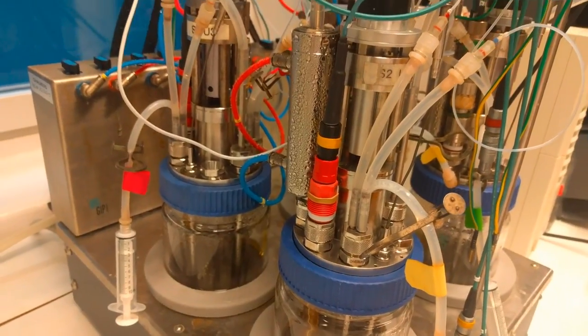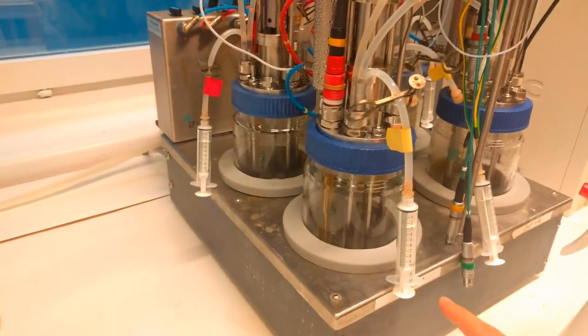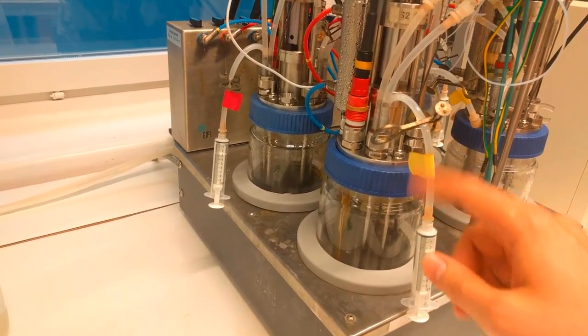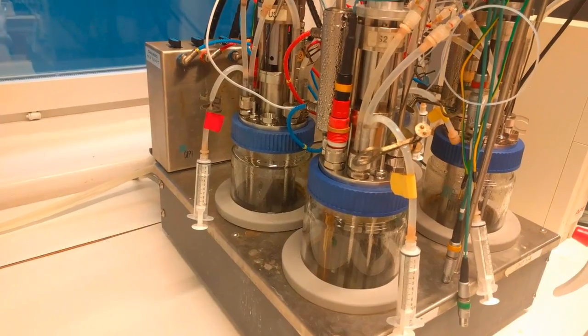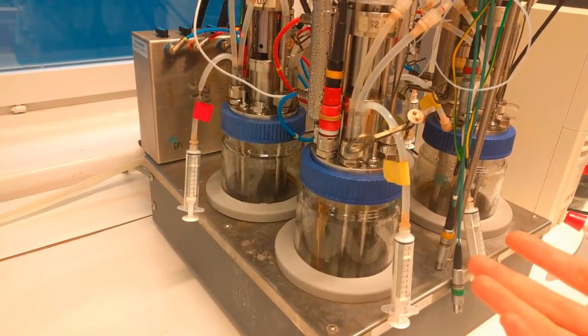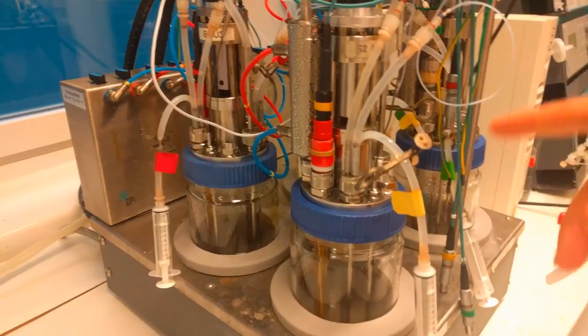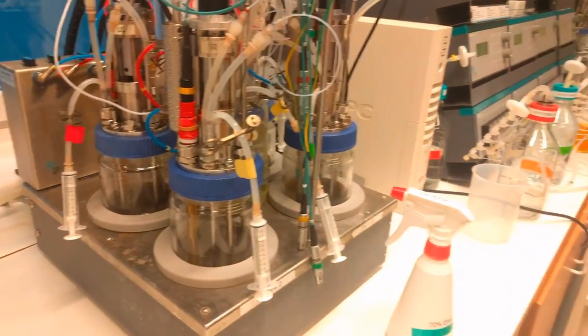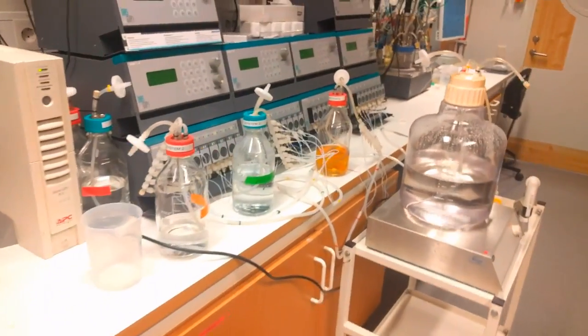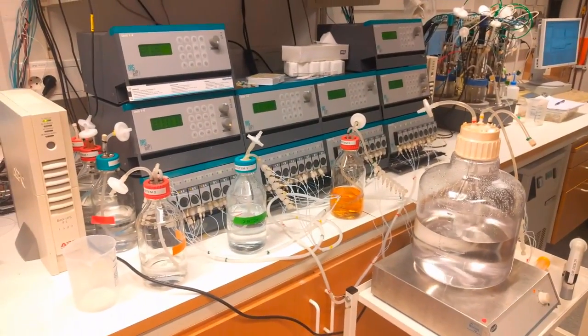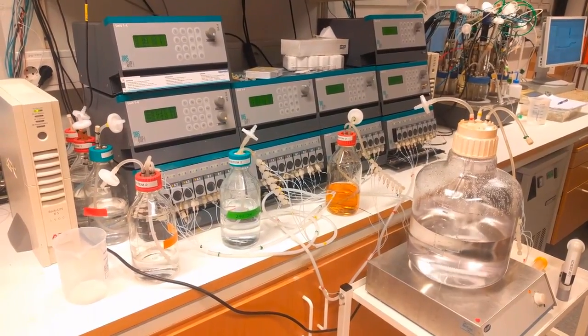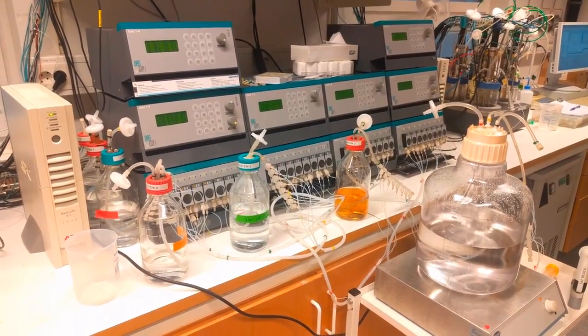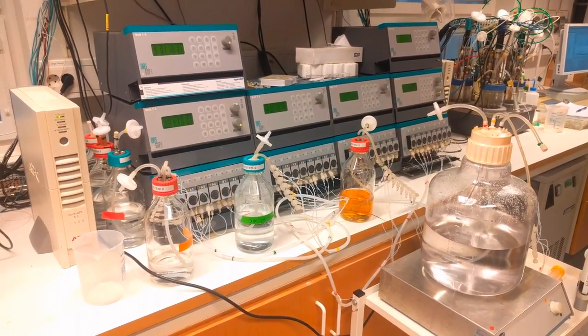One more thing to point out here is going to be this syringe that's hanging off the front. This is where this fermenter was inoculated. The experimenters put in yeast in this case, budding yeast, and they've pushed it in through the syringe at the very beginning of this reaction. This whole vessel is sterilized, and then we push in our yeast to start things off. The fermentation room - lots of computers, lots of equipment, lots of technology - but all of this works together to allow us to control our vessel and our reaction.